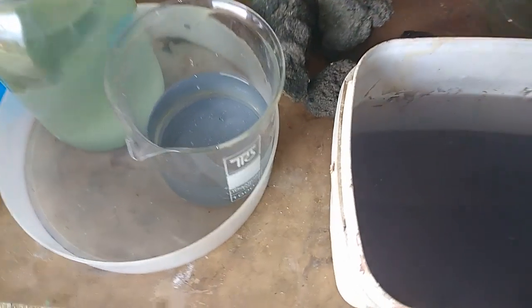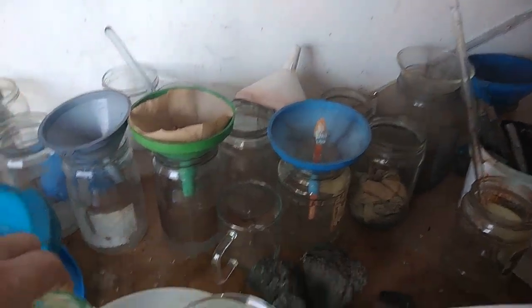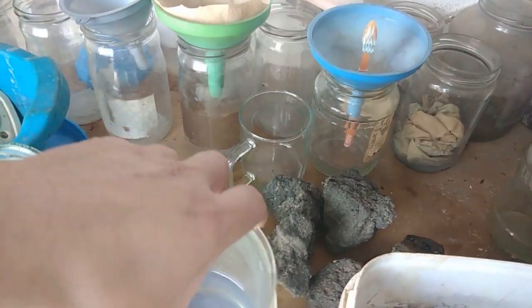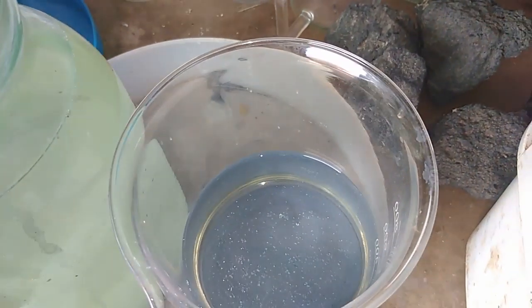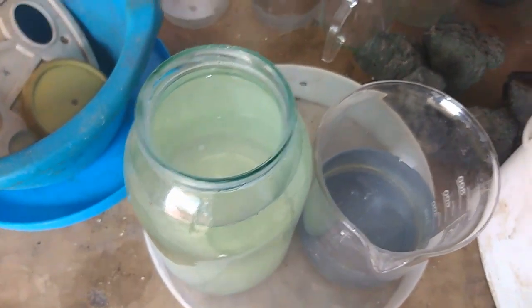After one day, the solutions have settled down. Look at that. This is our second rinsing water — see, inside on the bottom we have a purple slug. This is just a small amount of silver chloride. Here in this big jar we have more silver chloride. See that? Sorry about my table, it's a mess. And this is our main solution — we have some decent amount. It's already starting to turn purple because it's been outside. I'm going to decant it, filter it, and melt it to see how much silver we get.